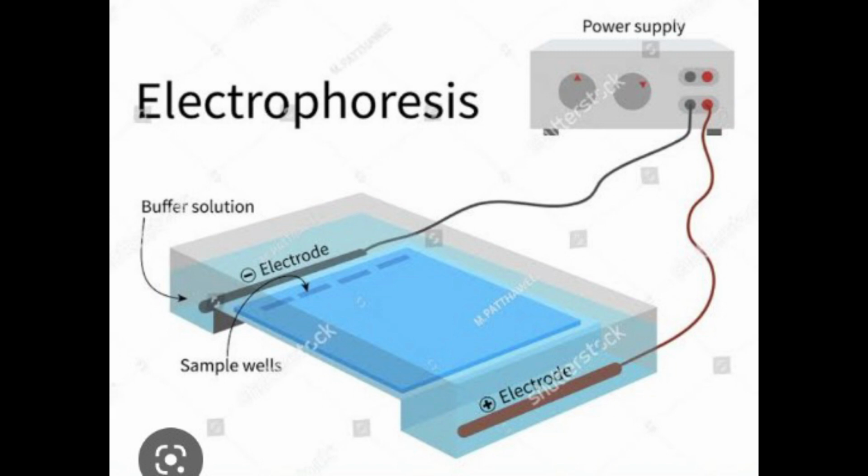Following electrophoresis, the gel may be stained, allowing visualization of separated proteins, or processed further. After staining, different proteins will appear as distinct bands within the gel. It is common to run a molecular weight size marker of known molecular weight in a separate lane in the gel in order to calibrate the gel and determine the approximate molecular mass of an unknown protein by comparing the distance traveled relative to the marker.